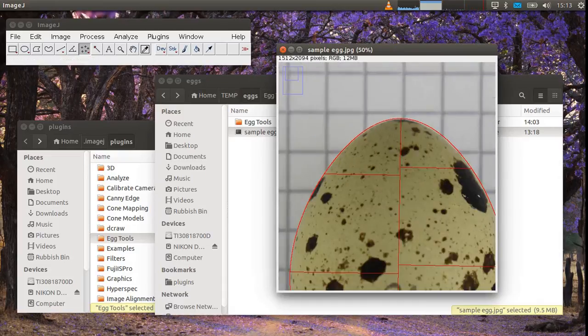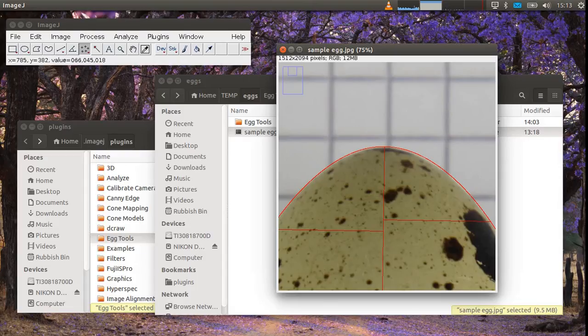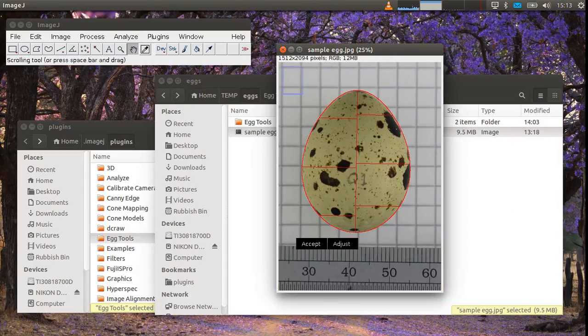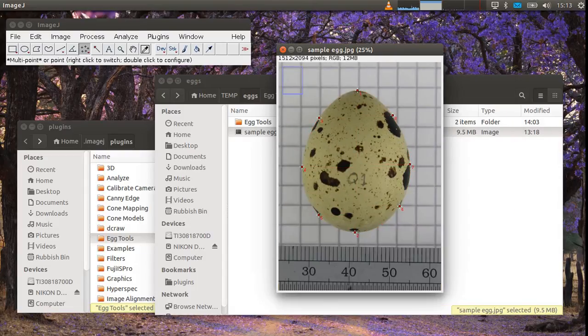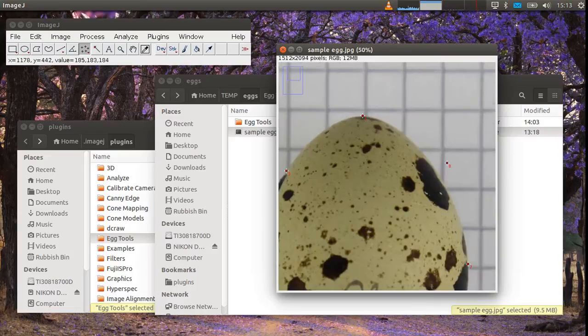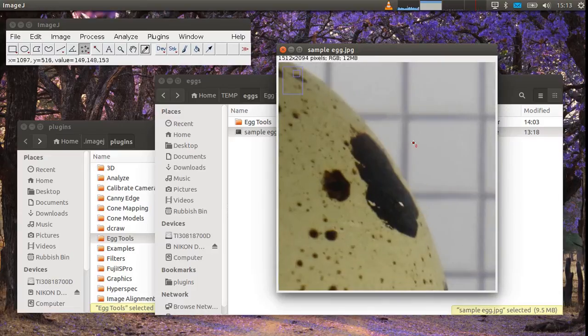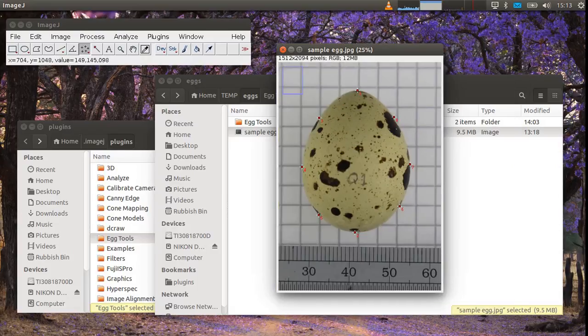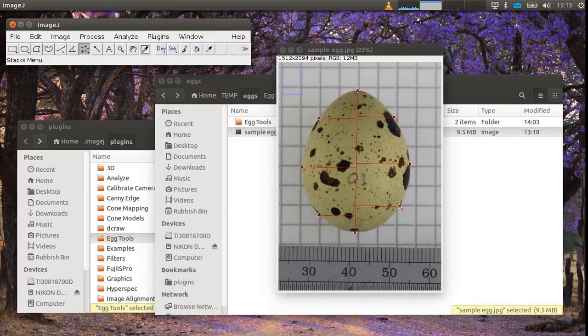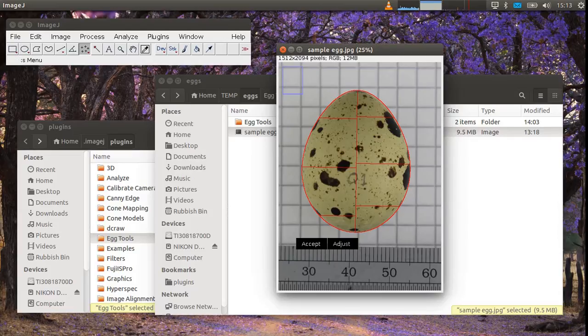And you can decide whether you're happy with this fit or not. If you're not happy with the fit you can adjust and say one of the points was a bit out. You now get the opportunity to reposition it and make sure you're happy. Once you're happy with the position just go egg measurement again and accept.